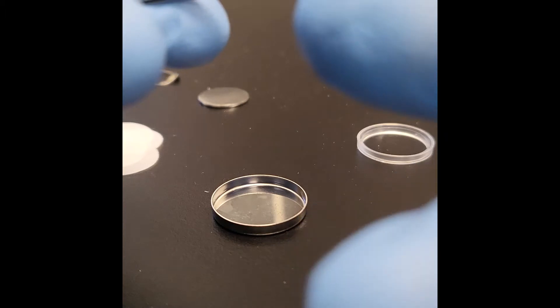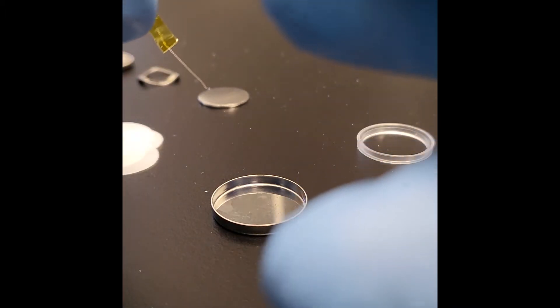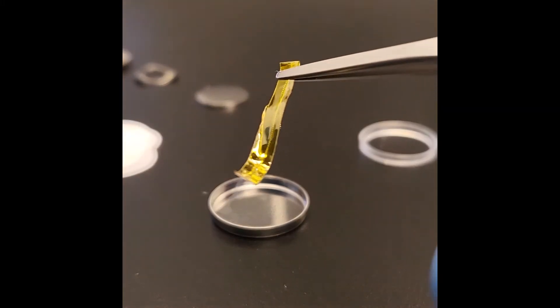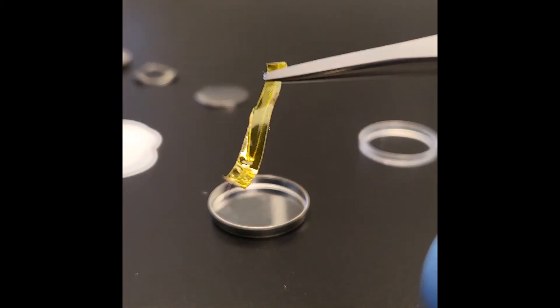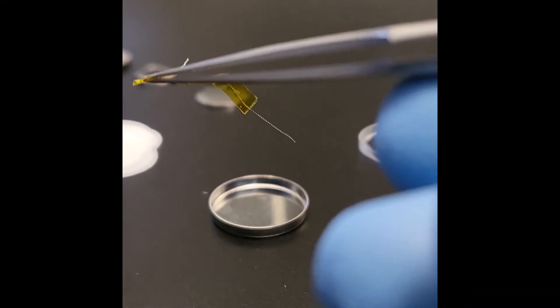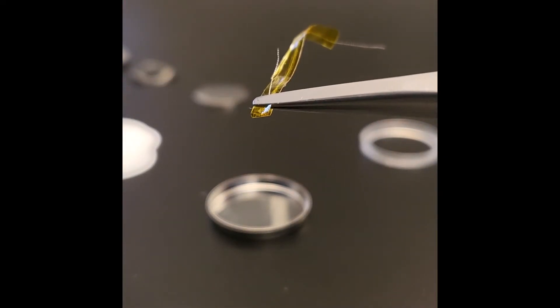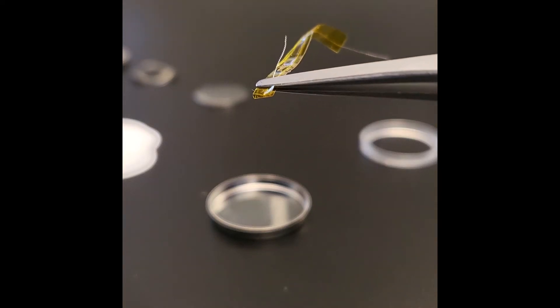We want to fold the end that will stay outside, and it will later help us prevent the reference wire from shorting the counter electrode. Here one end of the wire is folded to the back of the insulation. If we flip this, you can see the wire. Also note that the fold is made on the insulation, not on the wire or at the boundary.